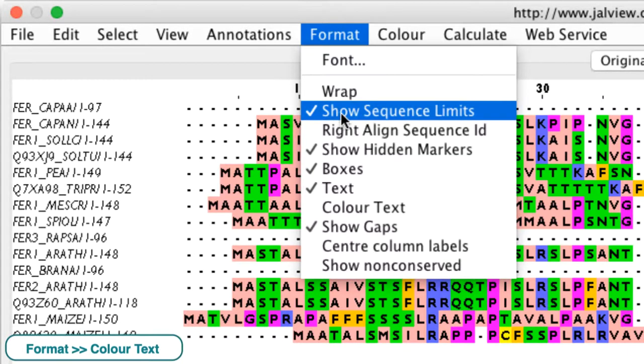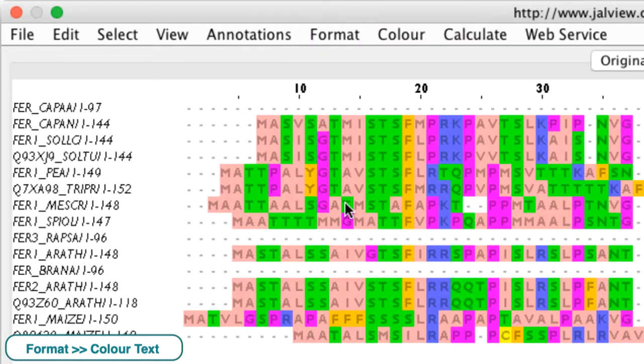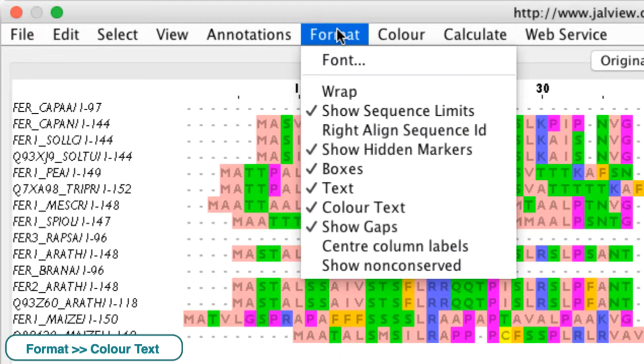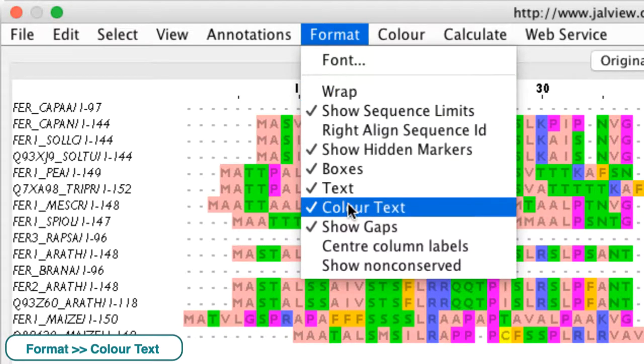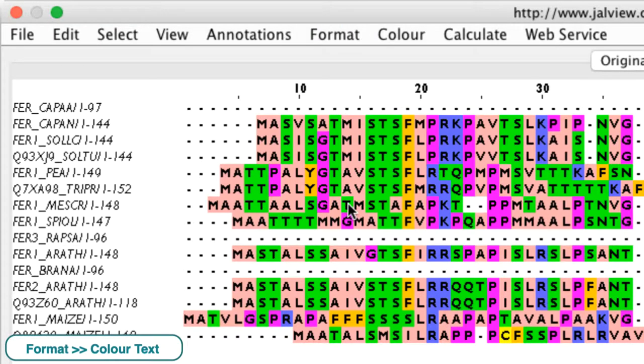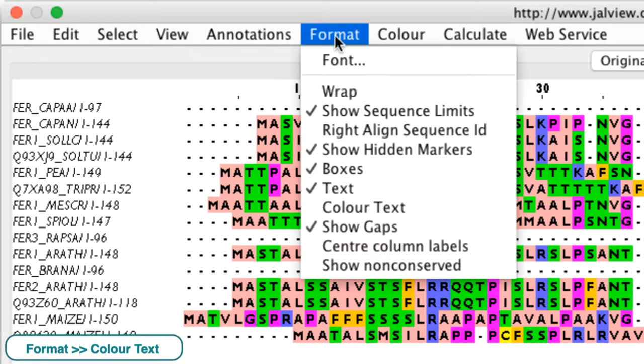Color text aims to improve the contrast between the text and the background and will modify the letter color according to the background color associated with the residue.